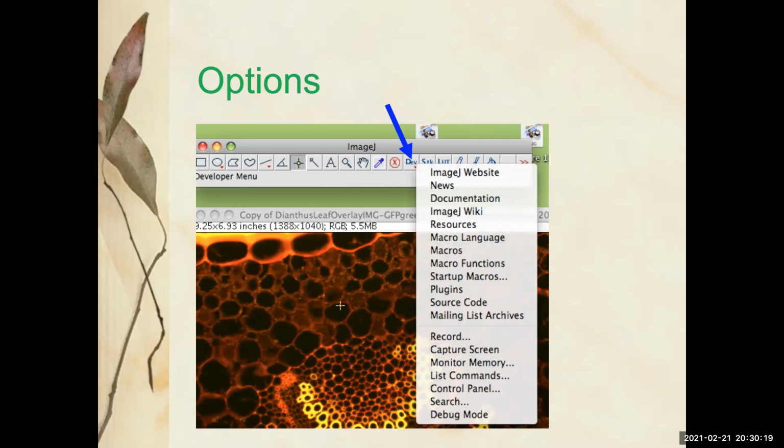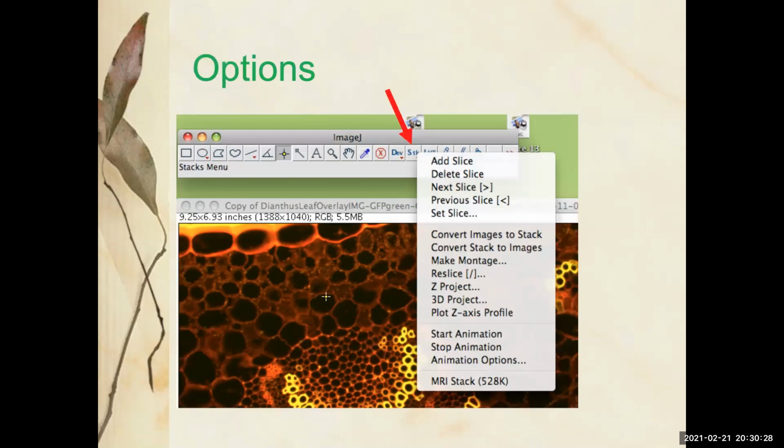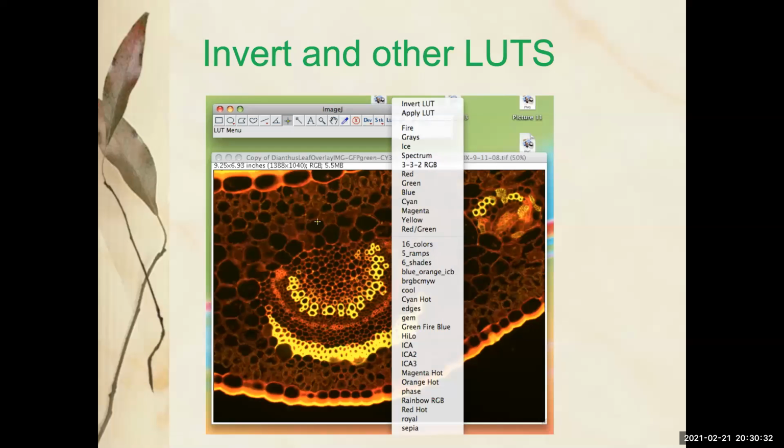To all these other, if you're into software, developing software, you can get lost for an entire 10 careers just on this. And they're always looking for people, by the way. So there's just lots of fancy stuff. I've talked about how there's all sorts of fun lookup tables you can apply that are just random, have no science value, but do them, they're fun. Just so you get a sense of what a lookup table is doing.